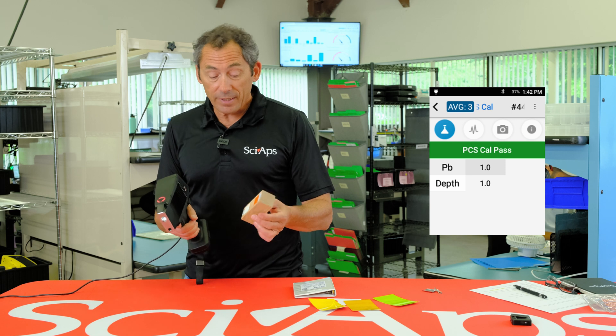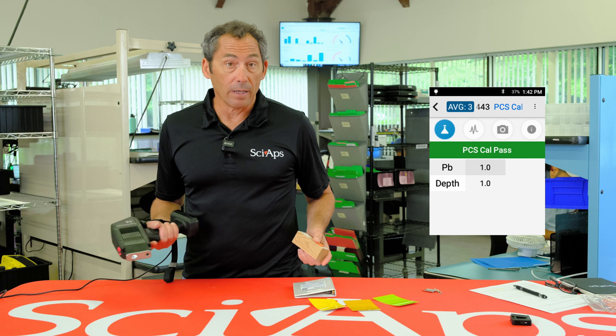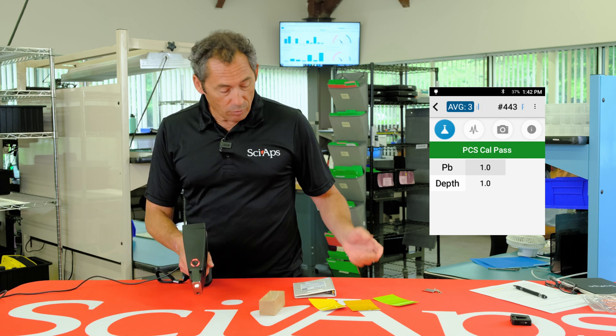If you're doing New York City testing, you have to do the same thing on the blank, and the software setup for New York City testing if you want to do that. And that's how the device works.